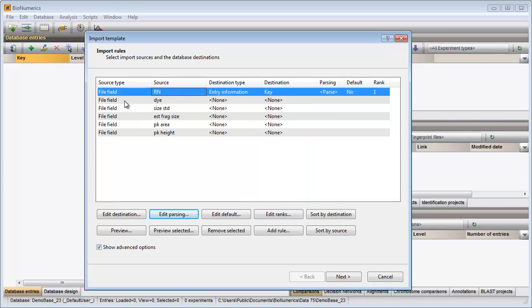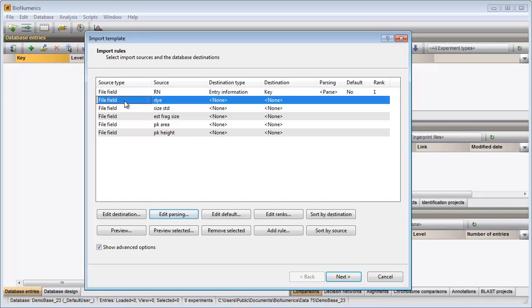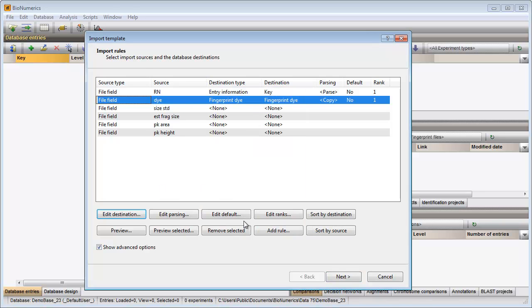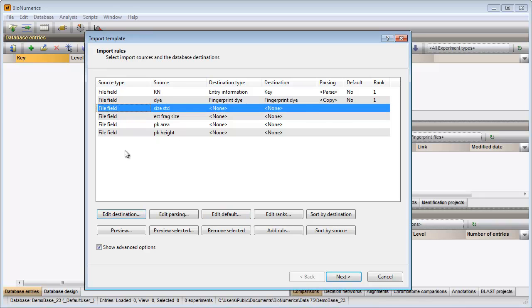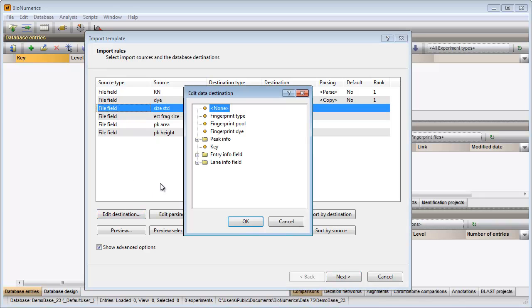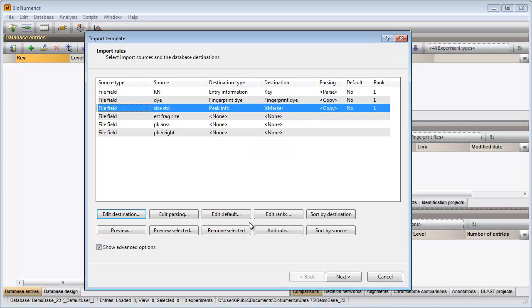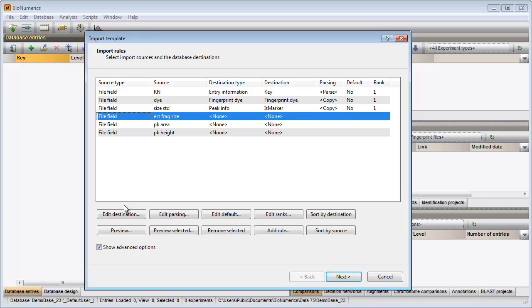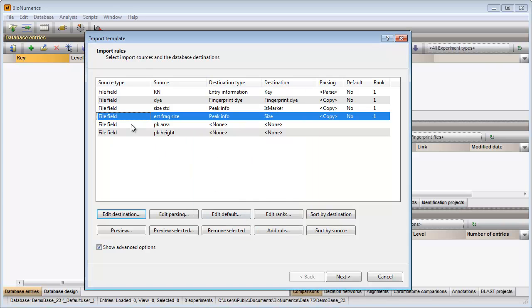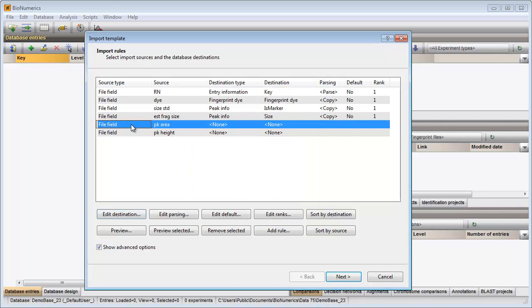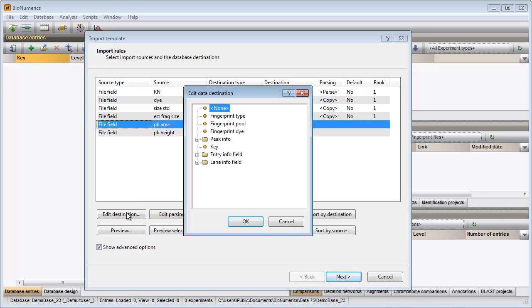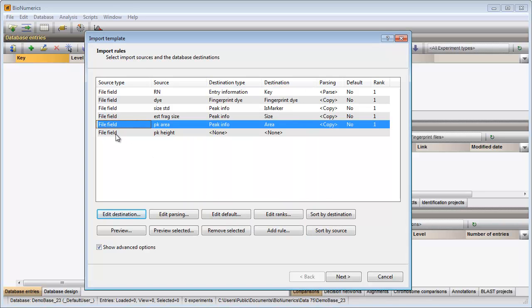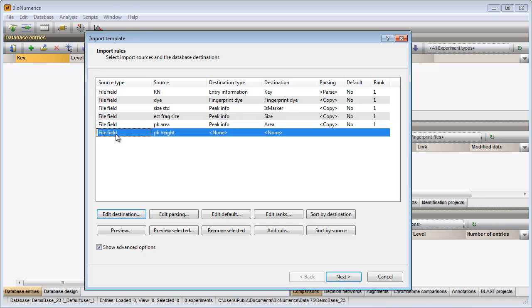Next, I select the die column in my peak file and link this information to the die destination. Finally, I need to link the last four columns in my peak file to the correct numeric peak fields. I link the first one to the marker field, the second one to the size field, the area column to the area field, and the last column to the height field.